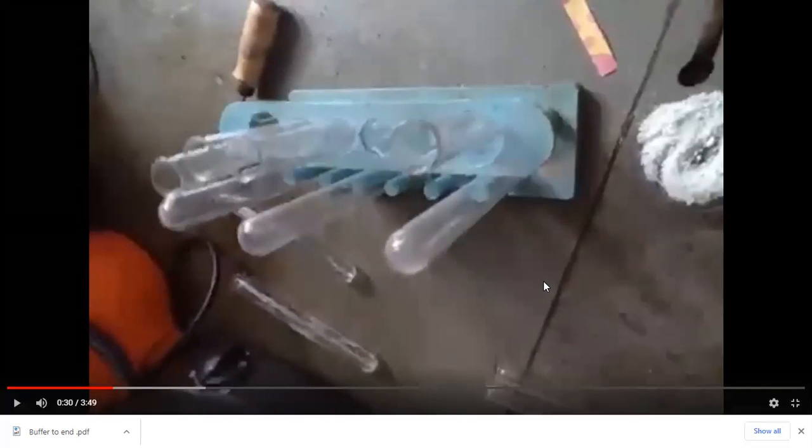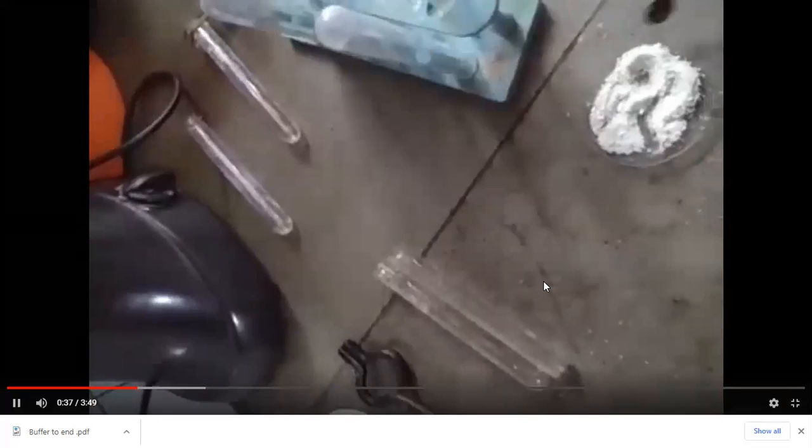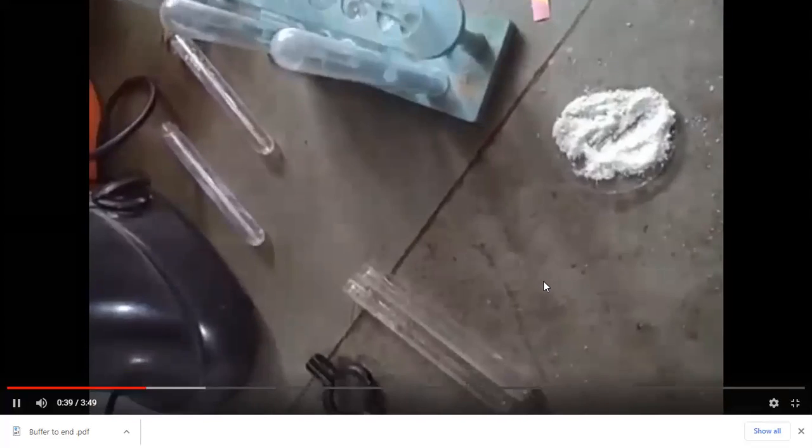So we are going to take these crystals into the test tube now. See, I am adding the green color crystals in a particular test tube. You can see it easily.